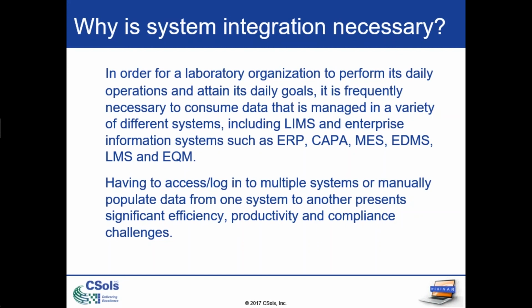So integrating a LIMS, in this case STARLIMS, with those other systems such as ERP, SAP is a common one, your CAPA or MES, learning management systems, your quality management systems is critical to be able to facilitate those decision-making processes with quality data, with rapidity.